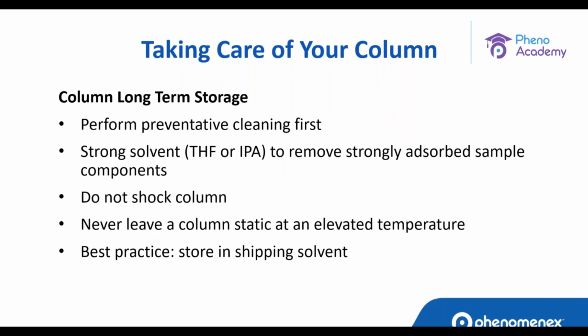For column long-term storage, we recommend you store your column in the shipping solvent. If you are planning not to use your column for at least two to three weeks, then we might consider using the shipping solvent to store your column for the long term.